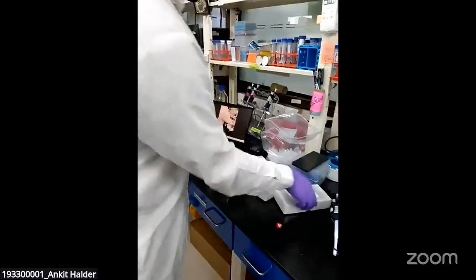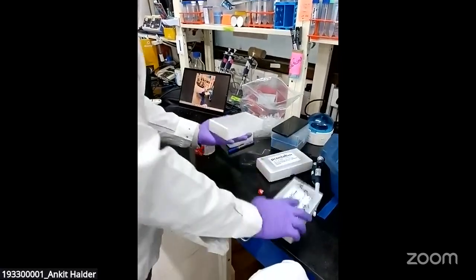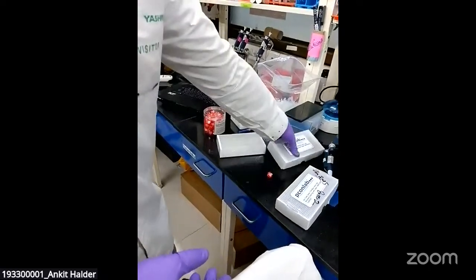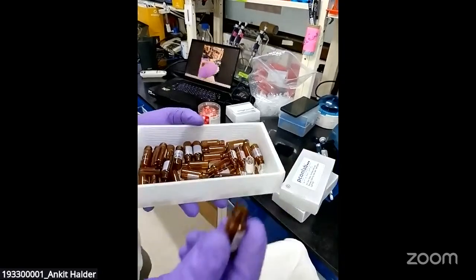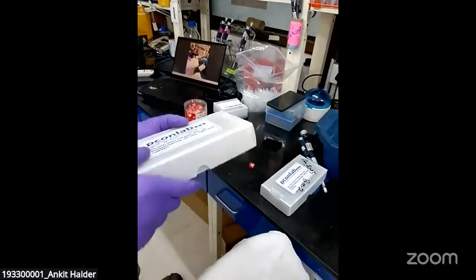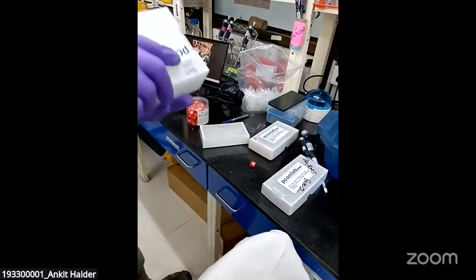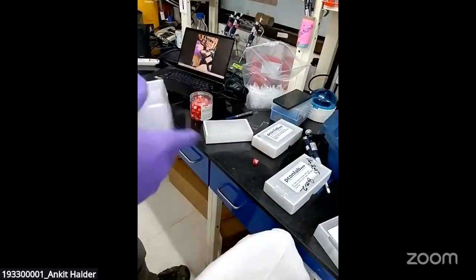In case of metabolomics, we use this kind of vials. You can see the transparent vials here. In case of lipidomics, we use this kind of amber vials. Amber vials are quite light sensitive, actually. The reason is that sometimes in lipidomics protocols we use internal standards, which are highly sensitive to light. So to keep them nice, we use these amber vials.